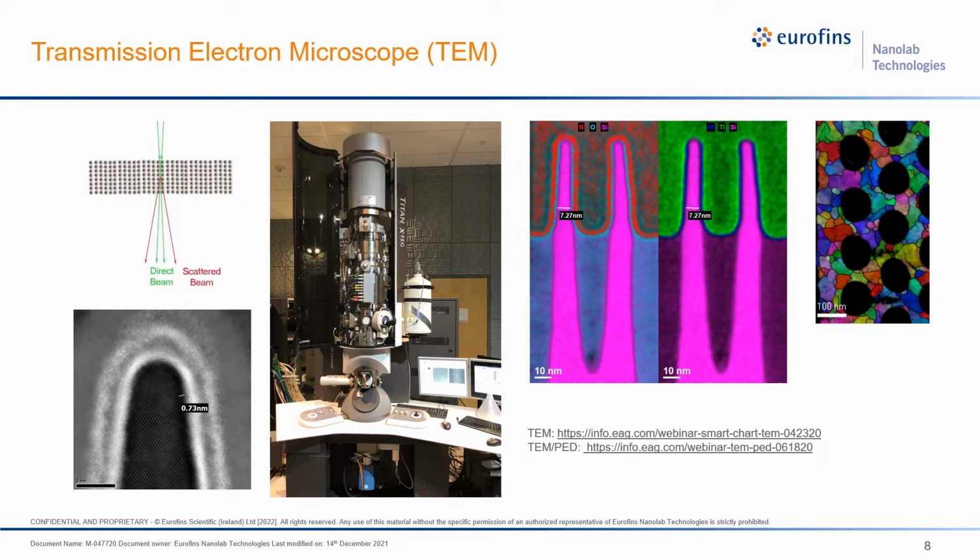So this is a brief configuration of a real TEM, a Thermo Fisher Titan. You can see the correspondence between these 2 pictures. This is an electron gun. Here are a couple of lenses and emitters to condense the beam. And here is a TEM sample. Here are detectors and cameras to analyze the beam.